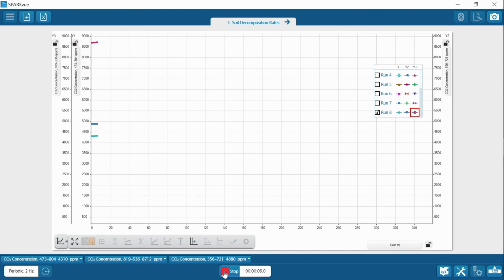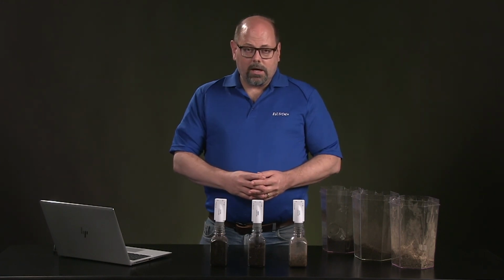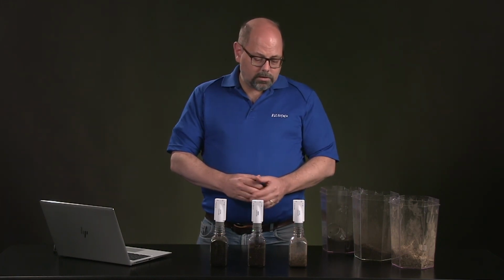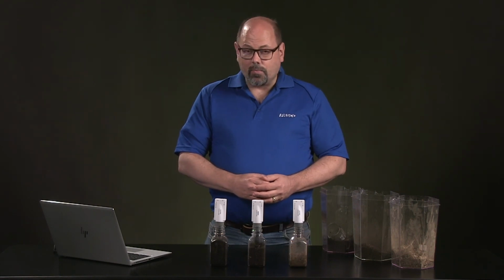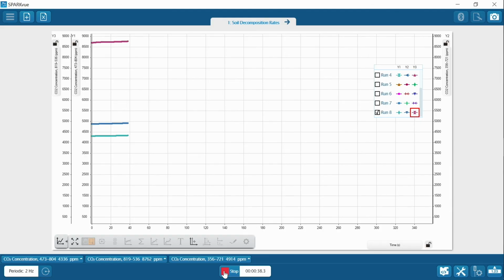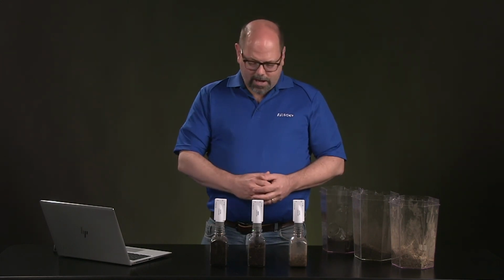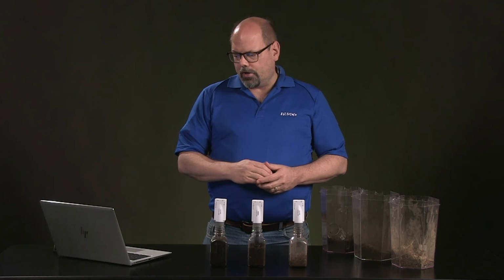You can see one typically has a lot more carbon dioxide in it. And that may be due to the rate, even though we took each of these and made sure we had calibrated it in its own clean sample jar, because the carbon dioxide level is about 400 parts per million. It's described well on the website, PASCO.com, under the documents section, of how to do that. And we'll just make sure that we get a good run for about a minute, unless some air can get in through the side or something. In which case, I'd like to get at least a minute of good, steady data coming off of each of these.